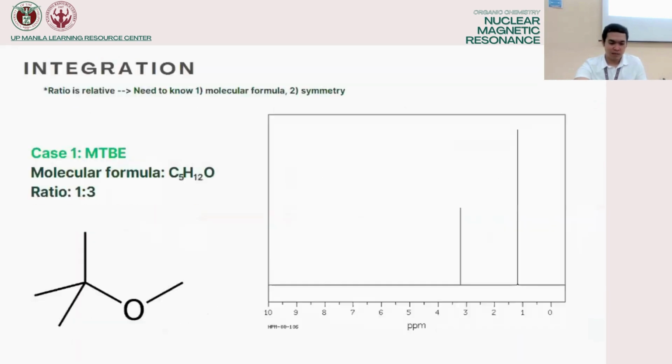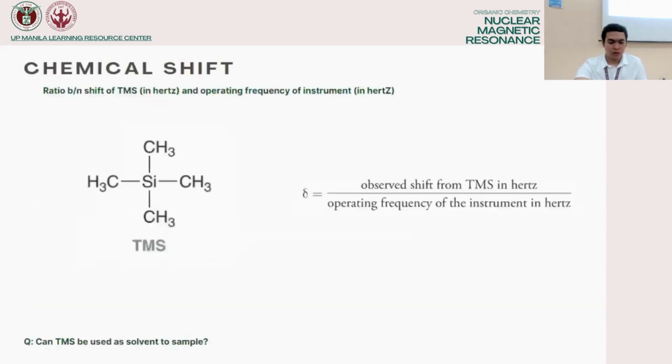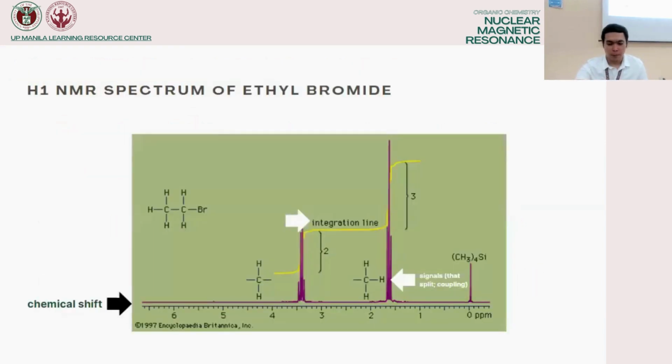Sige. So summarize na lang natin before we end. So naiintindihan nyo na itong tatlong to. Chemical shift, integration, and splitting. Naiintindihan na? So, okay. So siguro kayo yun ang basahin to kahit papaano. How about sa online class? Can you read this now based from our discussion? Sa mga nasa online participants natin. Ayun, okay. So, sige nga, last na lang.